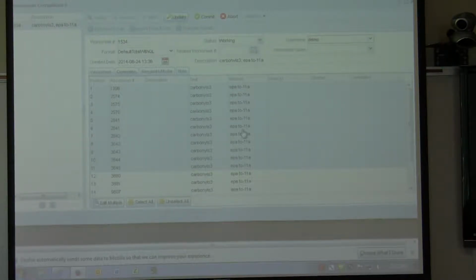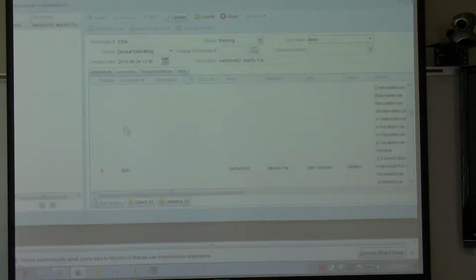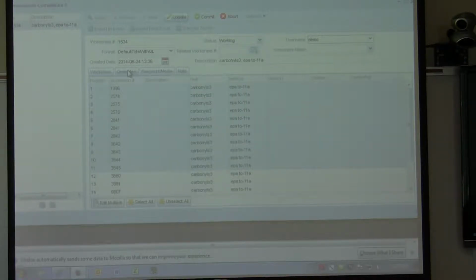Question, can you use that feature even if you have a format that does have formulas for the override? Yes, you can do the overrides. But if you have formulas in your Excel file, you probably don't want to mess with this tab. You just want to do export and import just like you did before. So yeah, you can do your overrides tab there as well.